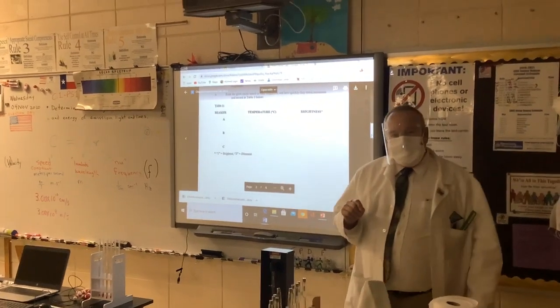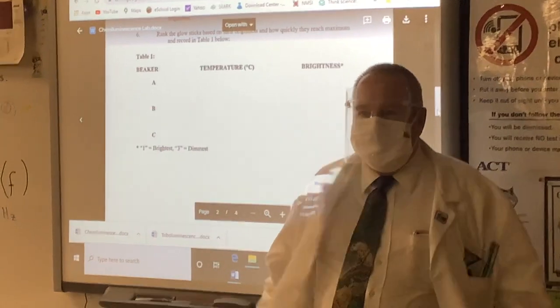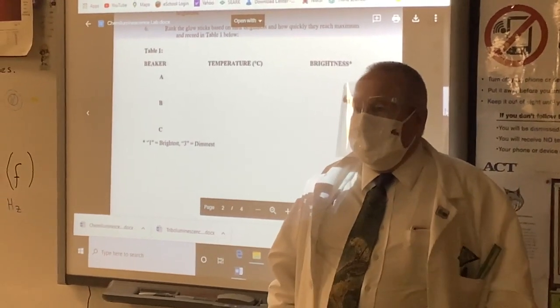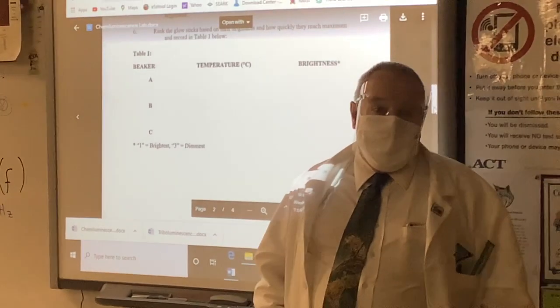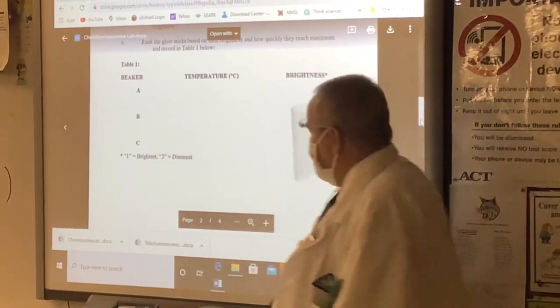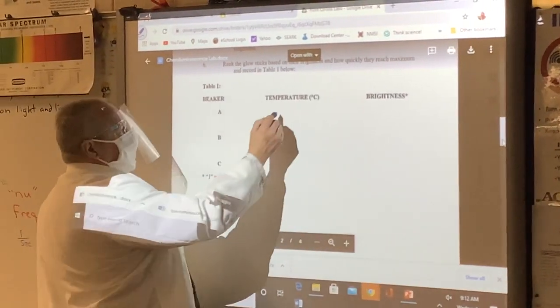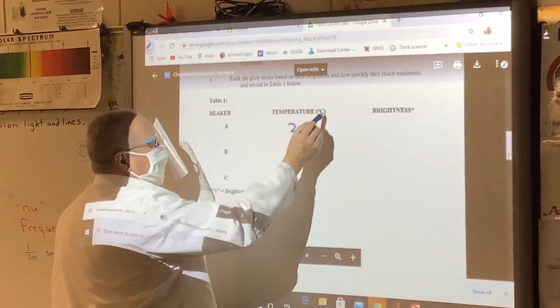Hello, my dear students. I want to complete the discussion of our lab report. This is the after-lab debriefing and discussion of what we saw and what it means. But let's record our data first. We had 3 beakers, one at 2 degrees Celsius.